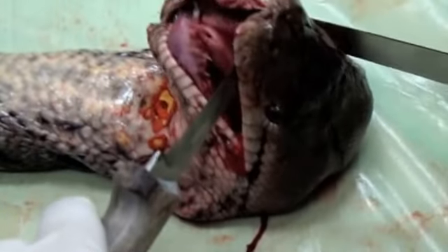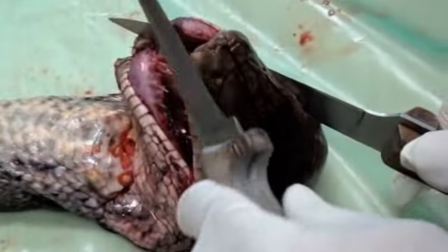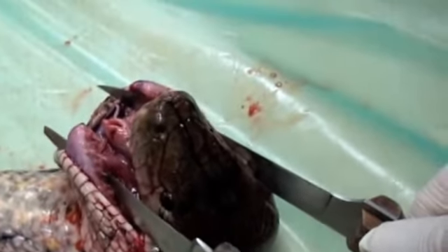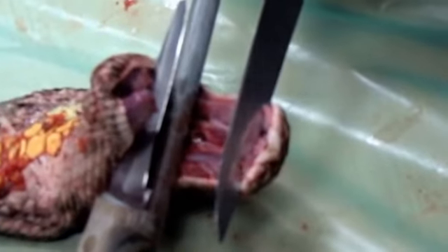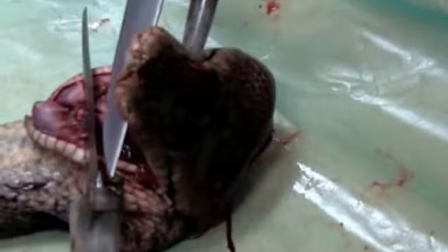So what's the use of the teeth? I thought both of these... This is a reticulated python. Okay, so sharp those teeth are. But see, there's another layer of teeth on the inside. They're really quite long, so you can see it. There's teeth on the outside, there's teeth on the inside. You see that? Those lower jaws.